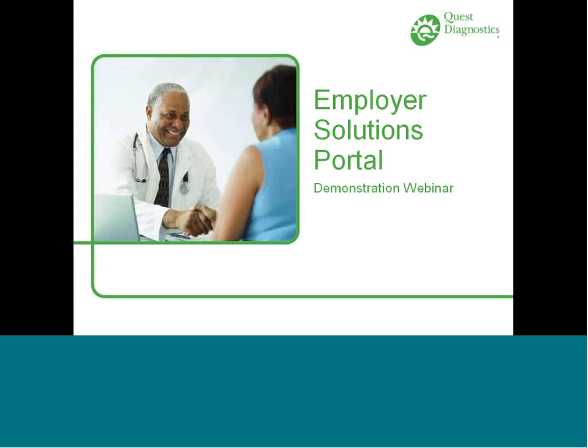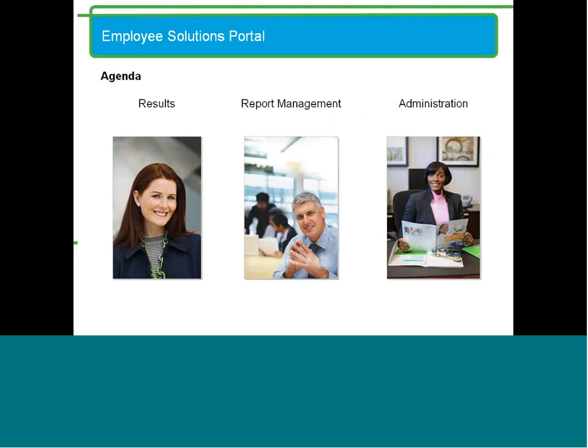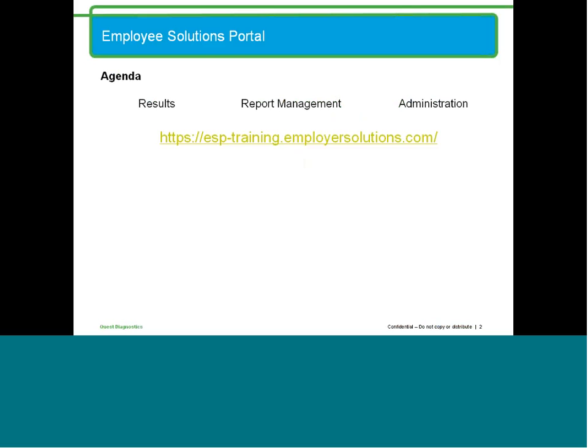This recorded session is provided as both a resource and reference for you to use as you become familiar with the new ESP system. During the webinar, you will learn how to access results, use administrative tools, and generate reports in the new system. Also, we'll show you how to navigate an ESP, as those of you using QIS will notice a great deal of difference between these two systems.